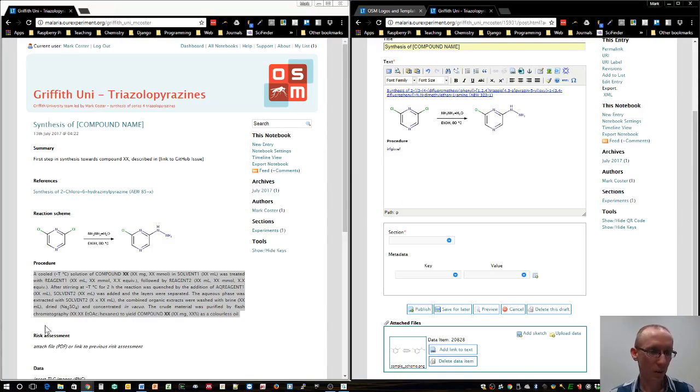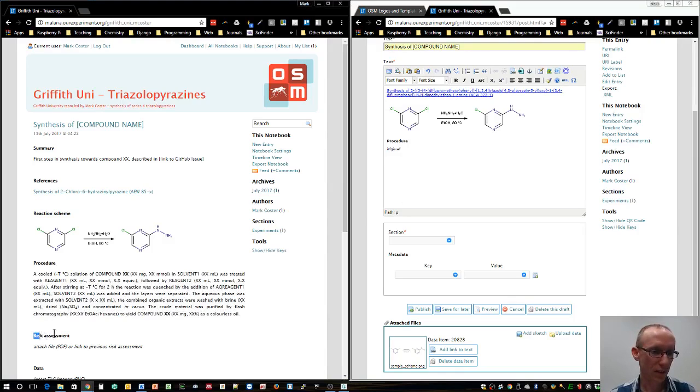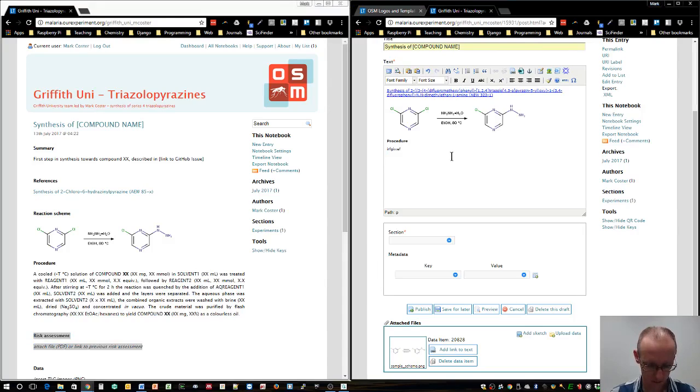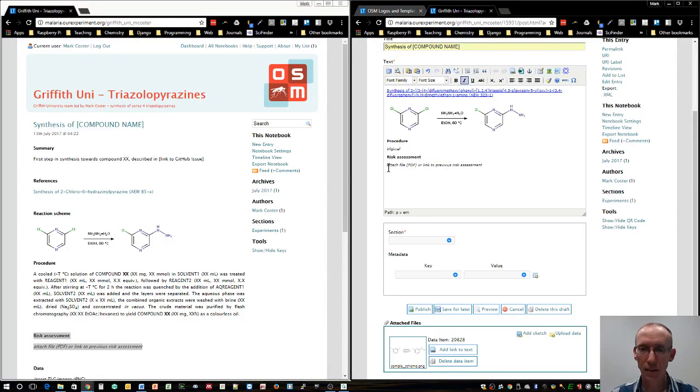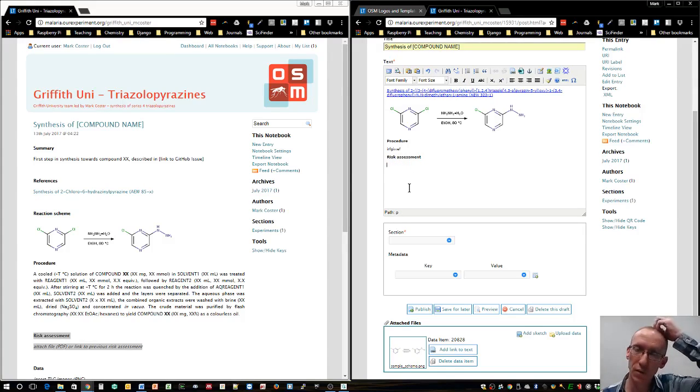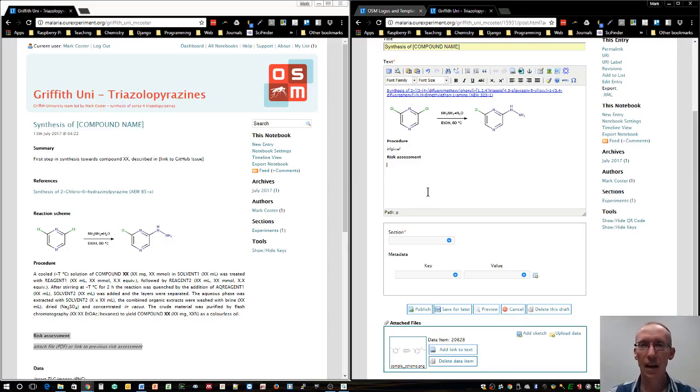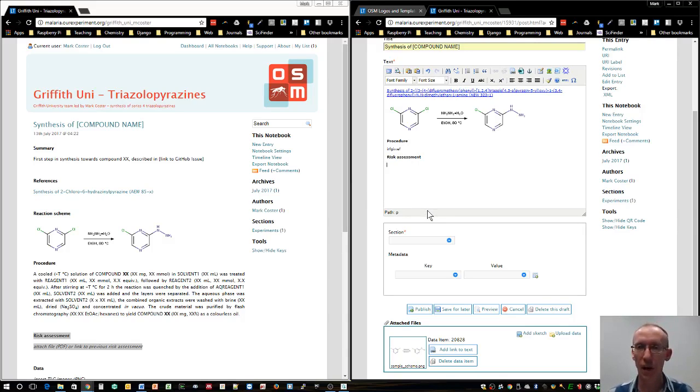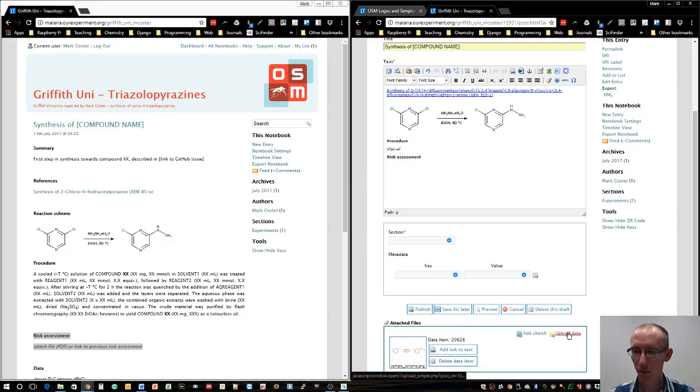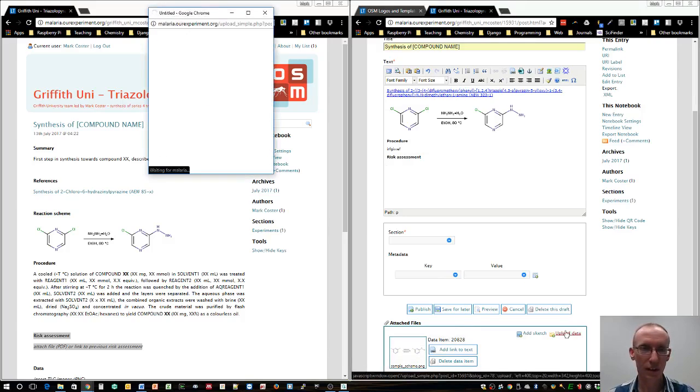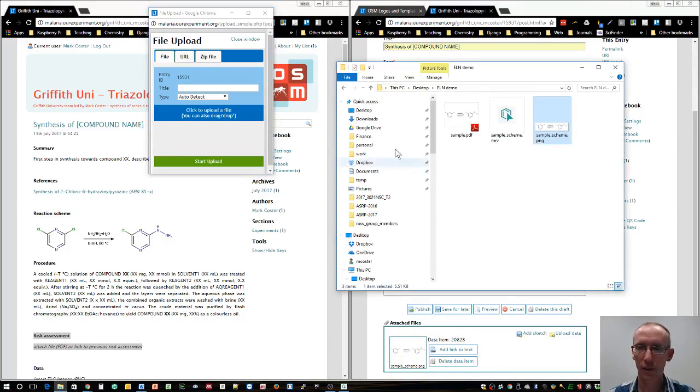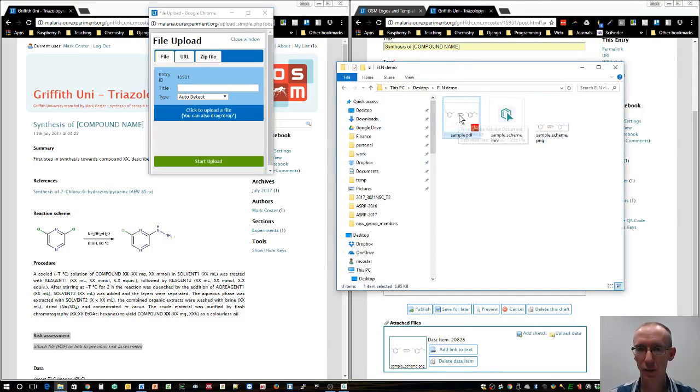Most importantly, we really need to have a risk assessment for all chemistry reactions we're doing. I'll cut and paste that. I think the best way is to attach a PDF file. At Griffith University, we've got our own risk assessment procedures. You can generate that PDF, upload it to the website, and paste that in as a data file. We'll go upload data.